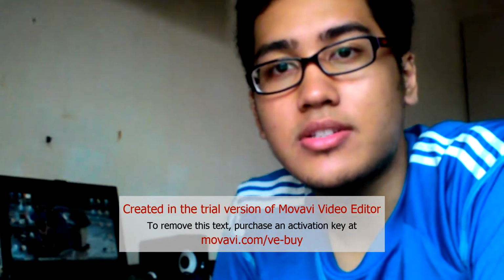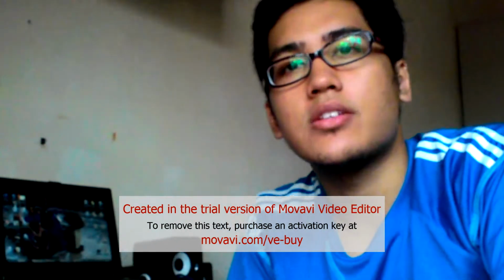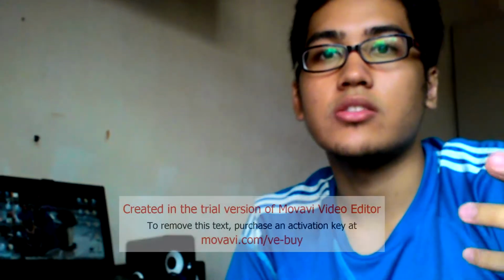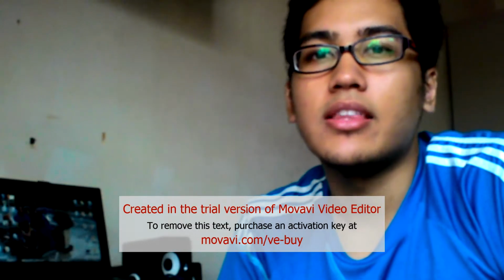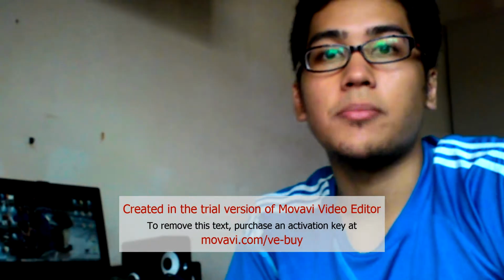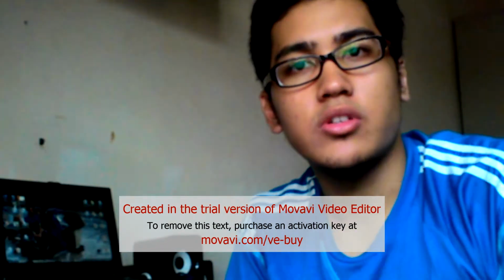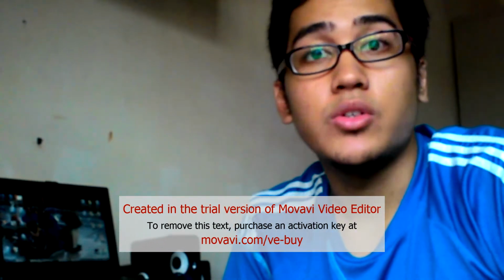So first of all, I'm going to discuss about the solar receiver. A solar receiver is also known as a continuous tubular loop. Now, a continuous tubular loop is a set of continuously recirculating of culture, which is usually algae, from one tube to another tube, and usually it is being pumped by the airlift or mechanical pump. So I'm going to show you this video while I'm going to describe the video itself.